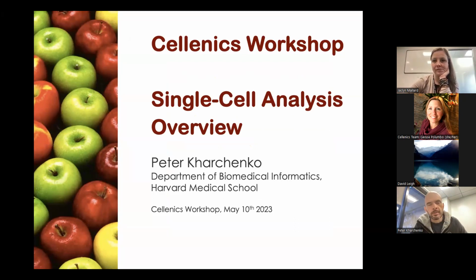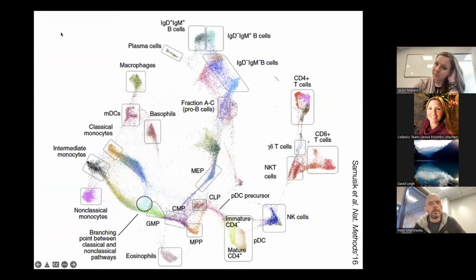It's sparse, it's noisy, it can get quite large, and so a number of tricks have been developed along the way for how to handle it, how to normalize it, how to get stable results out of it, and how to accentuate the differences or the patterns within this data. These methods are generally available in this platform, they're implemented there, but I just wanted to give a quick overview of what they are, to give you a bit of an intuition for them.